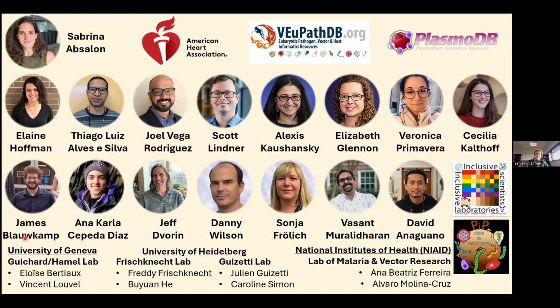So that's the RON11 low. I wanted to call it a knockdown. However, our collaborator was very strong on not calling it a knockdown because it's a promoter swap. So we've gone with the low naming system.